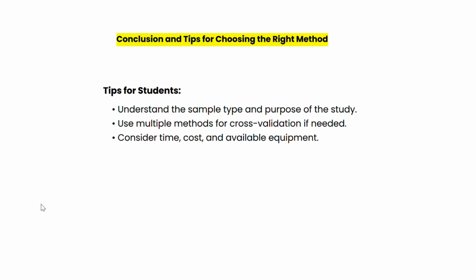In conclusion, choosing the right method depends on the type of microorganisms, the nature of the sample, and the level of accuracy required. I recommend using a combination of methods when possible to get the most reliable results.